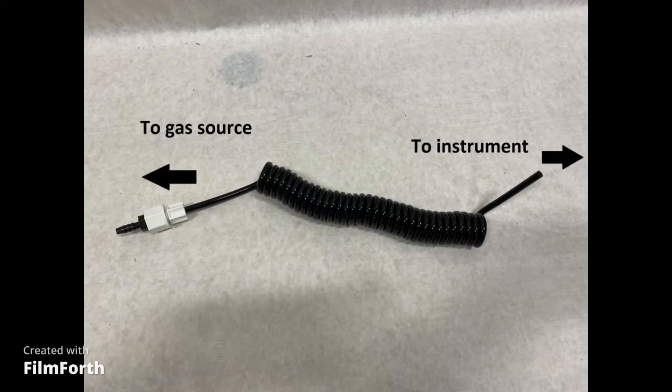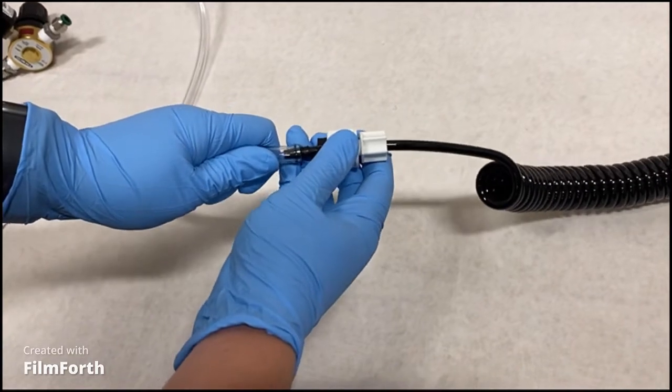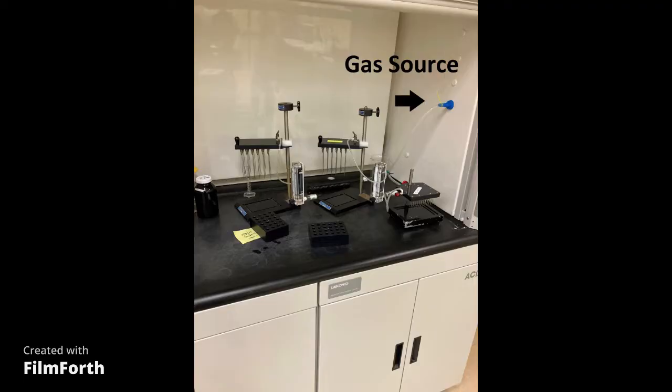This connection can be made in one of several ways, depending on the fittings your gas source has. The first way is to connect the barb directly to a length of quarter inch ID tubing. This is one of the most common connection types and is often used among those who have their gas piped directly through the fume hood, as seen here.